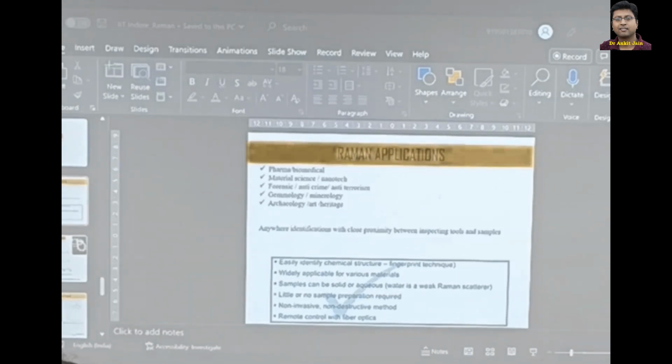Either you go from higher wavelength to lower wavelength, or you go from lower wavelengths to higher wavelength. Lower wavelengths will burn some of your enzymes and some of them will not, so you will know that this one is burning, and I will not go with this wavelength, I will go with a higher one. So you will have to start with a literature survey. If literature is not available, then this is how you do it.